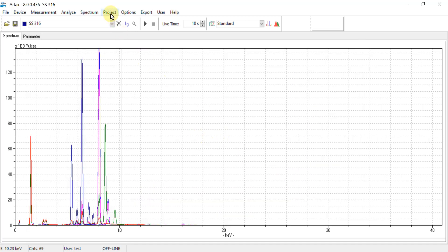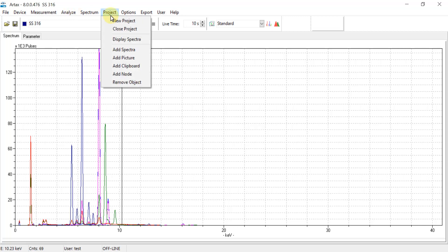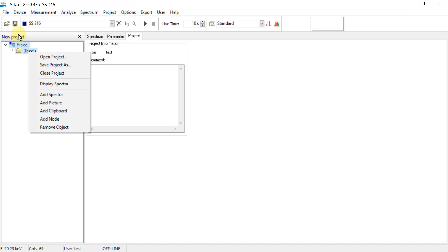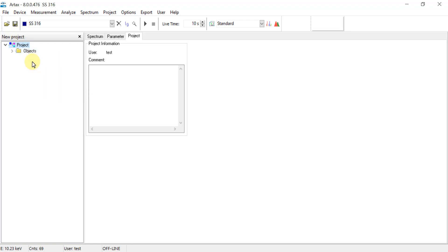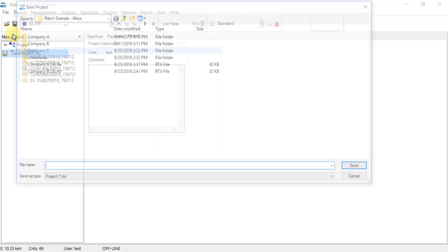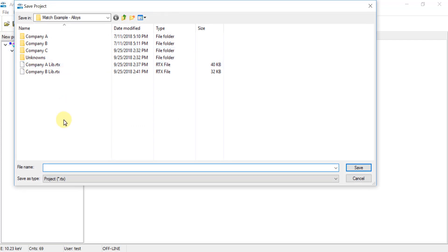Go up to Project, select New Project, right click on Objects, Add Spectra, confirm the list, and then File and Save Project As.